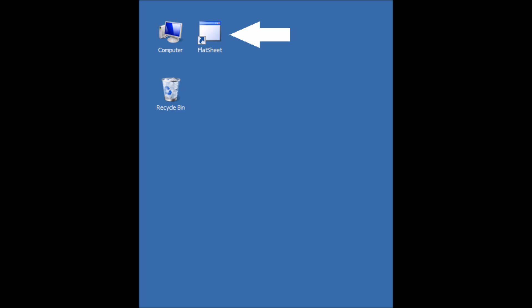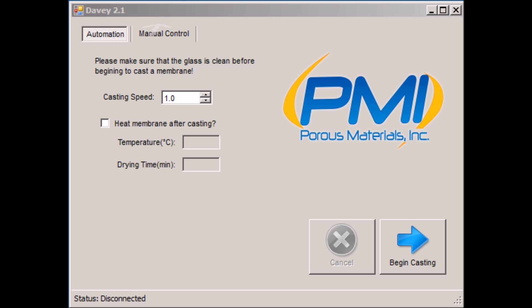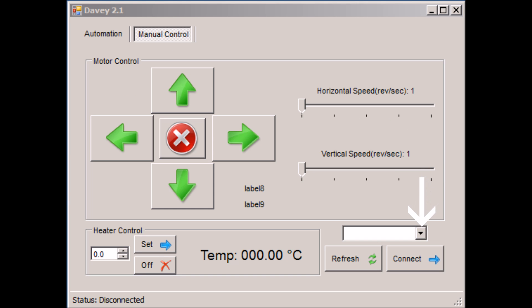Click on the flat sheet icon to open the software. Then navigate to the manual control panel using the tab at the top. Manual control allows you to select your COM port, connect to the machine, change the vertical speed of the doctor's blade, change the horizontal speed of the membrane plate, and change the direction.